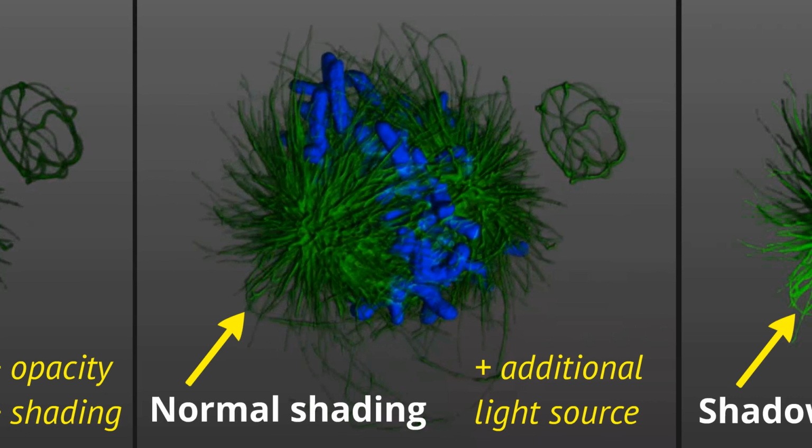So in adding that additional light source, this little yellow arrow I have here is showing you the orientation of the light source. That is adjustable by yourself. You can move that flashlight and have it shine or direct light in a particular orientation. It also really helps to emphasize surface structure. So if you're looking at muscle cells, or at the outside of an embryo, you can really highlight the surface structure with this technique.